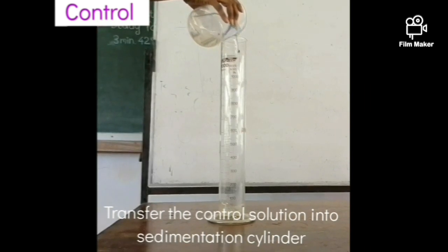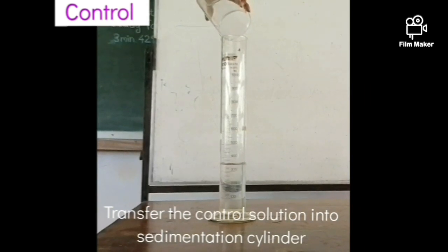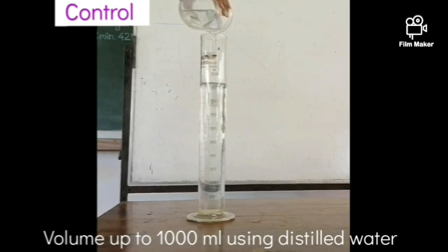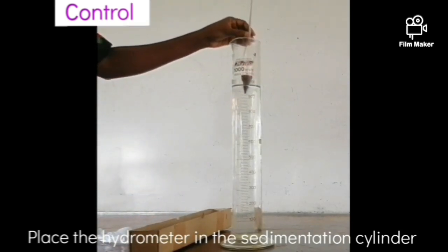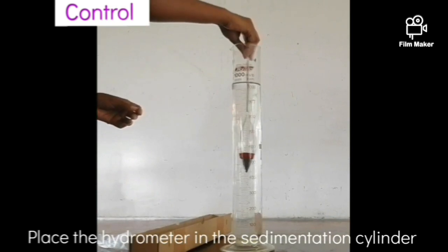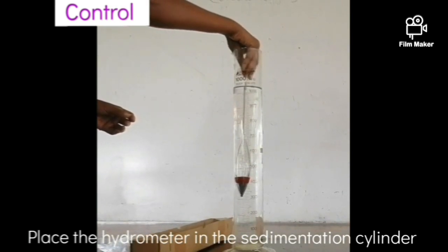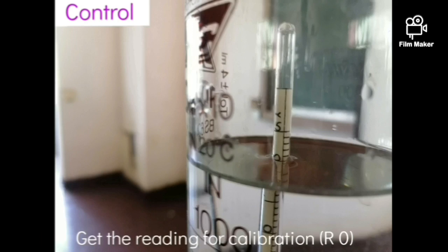Afterward, add the prepared sodium hexametaphosphate control solution into a 1000 milliliter sedimentation cylinder and top up with deionized water to the mark. Then carefully place the hydrometer into the cylinder and get the reading as R0 for calibration.